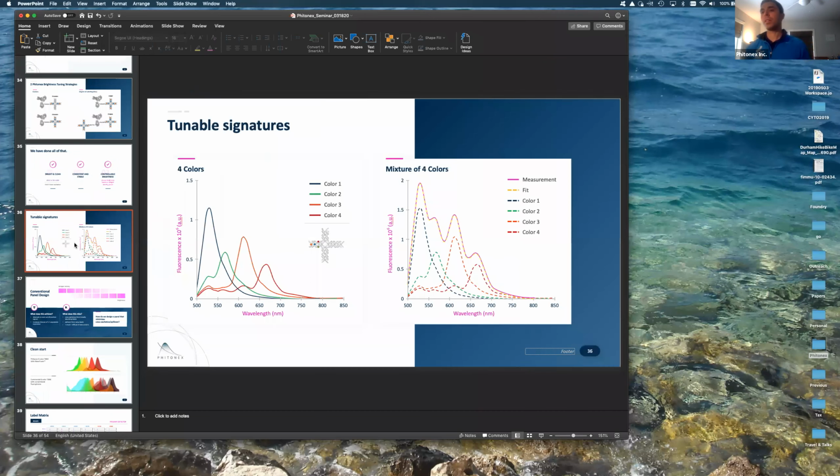Yes, got it. So yeah, this is interesting. What we did for this work is take component organic dyes that we knew worked on platform, and we created 4 different 1 cluster spectral dyes, right? You can see here, this is cartoonized, but it gives you a sense of the kind of fluorophore networks that we could create to create a spectral dye. This is the measurement that you get out when you measure it on the spec, right?